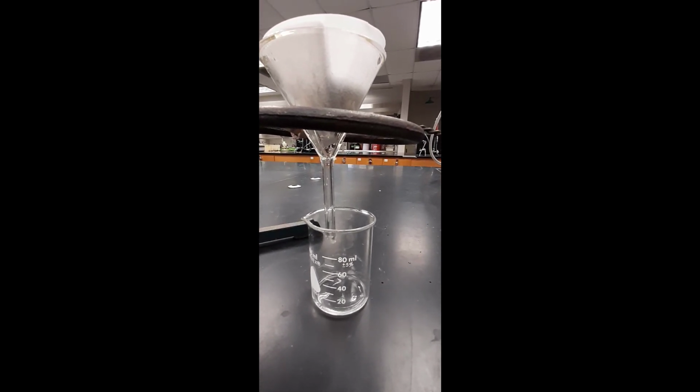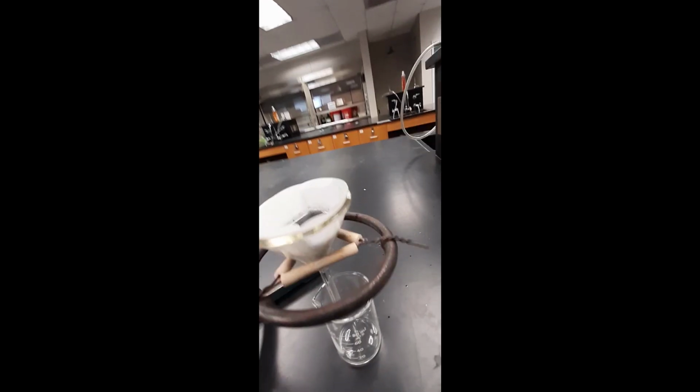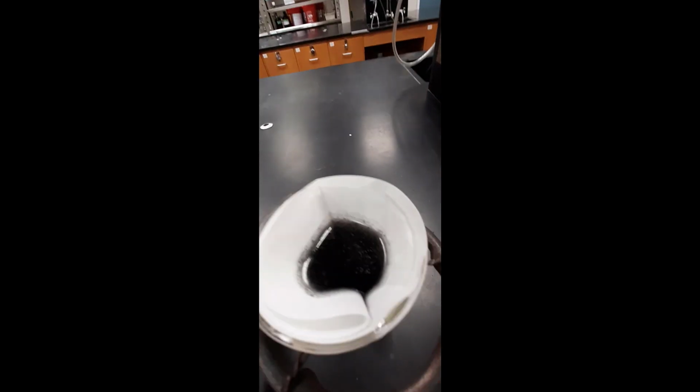Observe that the liquid draining out of the bottom of the funnel appears to be clear and colorless, implying that the charcoal is all being left behind on the filter paper.